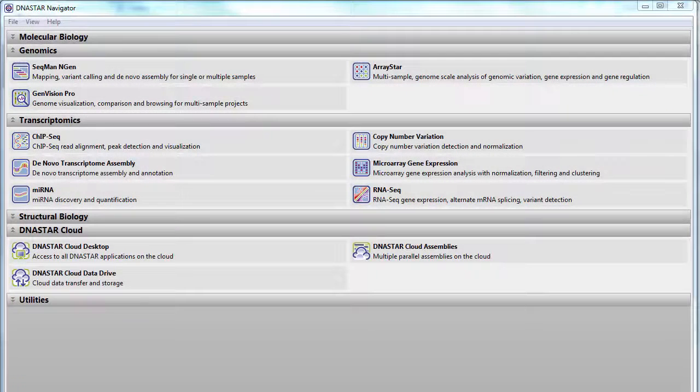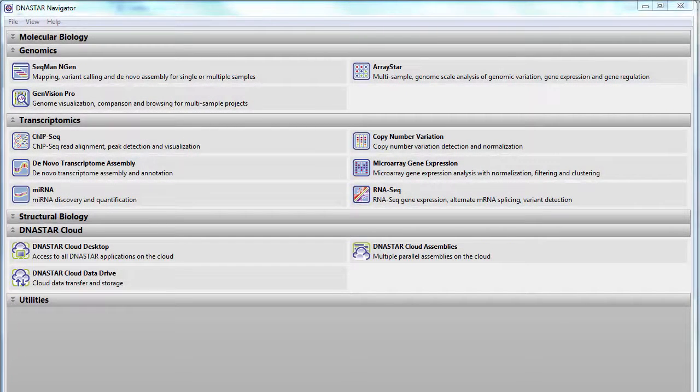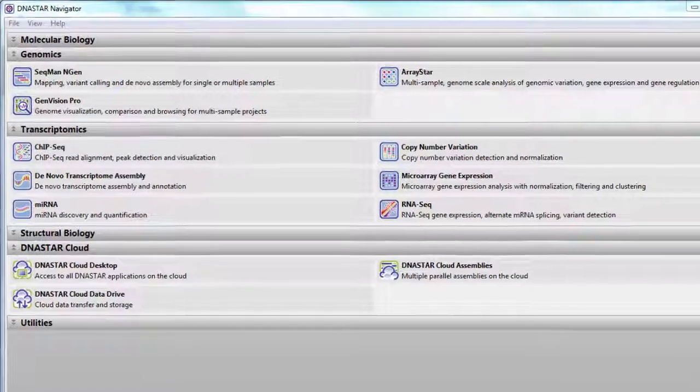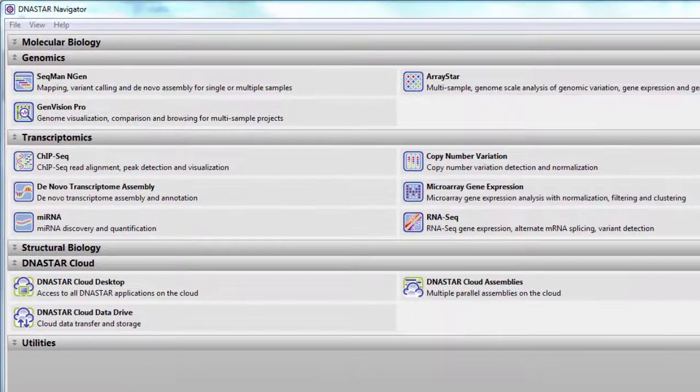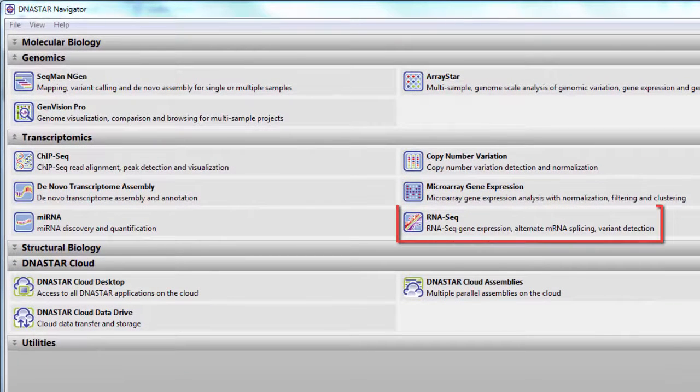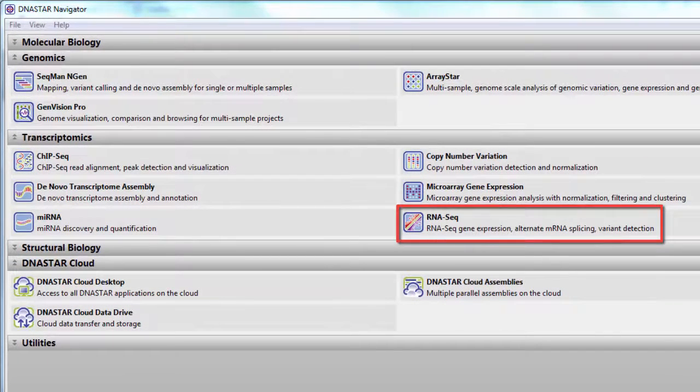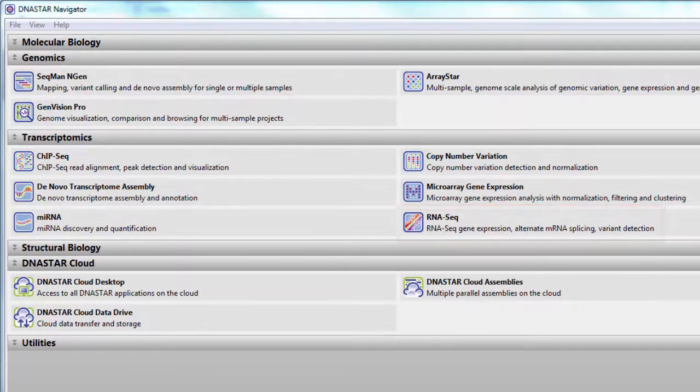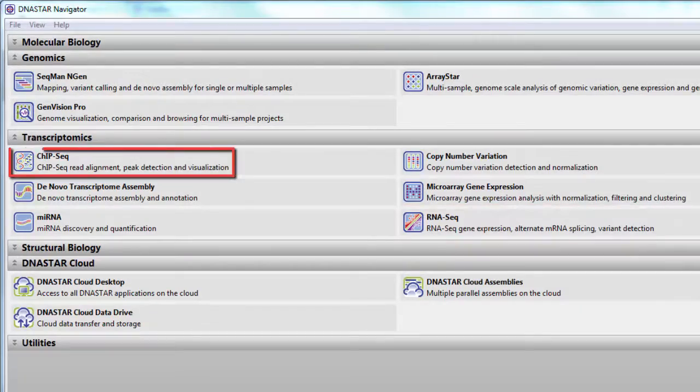DNA Star now offers a combined workflow for assembling data from multiple NGS projects together. In this video, I'm going to combine an RNA-seq project with a ChipSeq project.